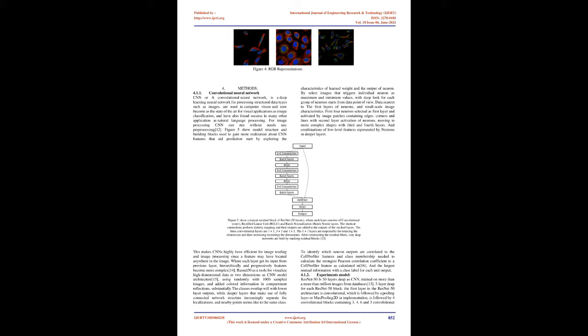Now we are going to create a new fully convolutional ResNet-50 function as the baseline for further receptive field calculation, and use the available training dataset to train the model. Stratify based on the combination of labels in the dataset. The unique combinations will be put into train, which gives 559 images with unique label combinations out of 21,806. Then using the green filter, as the green filter should be used to predict the label, and the other filters are used as references.